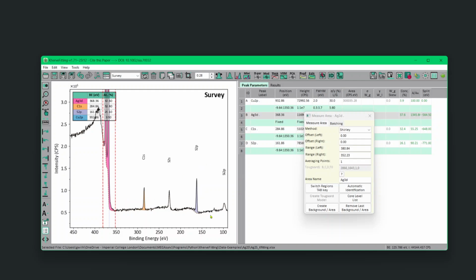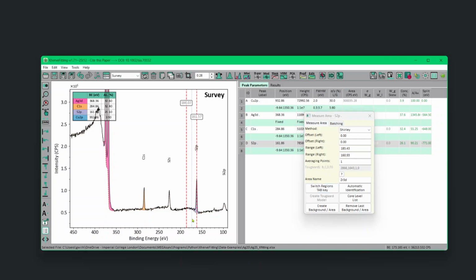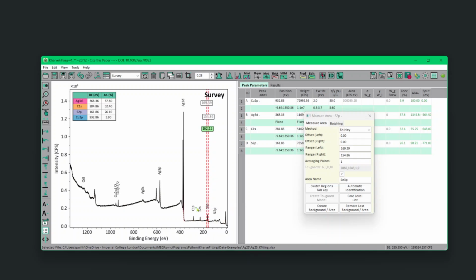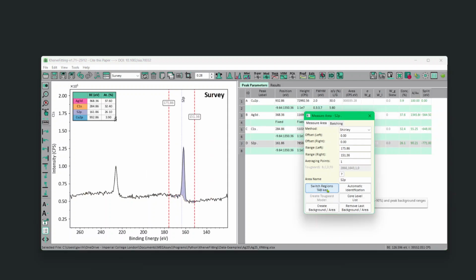Okay, and we can do the same maybe with sulfur, because this is what we are interested in. The rest seems okay, but let's continue. So silver, carbon, and now sulfur. We go again. You see it's not moving, so let's just go somewhere here and maybe somewhere around there. Sorry, it's added selenium. That's one of the things you have to make sure is on the right number. So let's just remove selenium. Let's go back to our carbon, and let's choose again, sorry, sulfur.